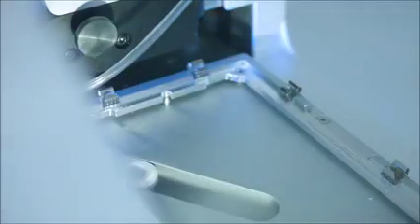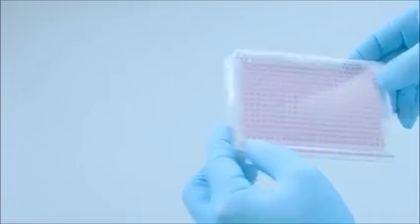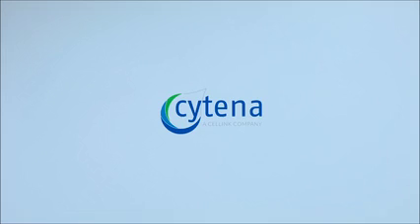So this video shows you what the typical workflow looks like, which starts with filling a cartridge with a cell suspension, attaching it to the instrument, and then setting up your workflow in the software, and then you're able to dispense individual cells into the well plate. And after a few minutes, you will end up with a well plate full of single cells in each well. So let me go back to the slides.